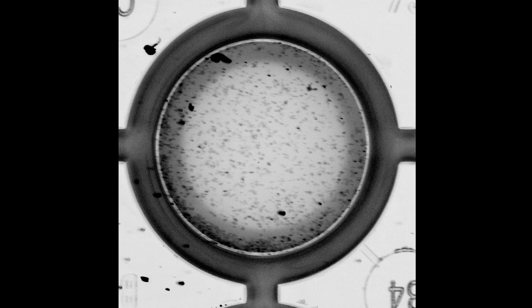So let's have a zoom at this part. And you can see here, right? These are really tiny cells or little tiny cell colonies in the well, which you can see already. So you see the resolution is really good for a scanner.